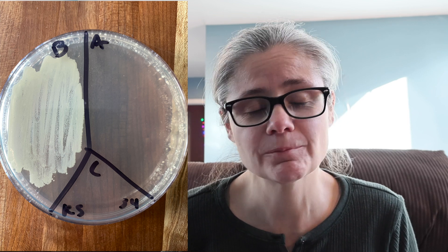Now for some results. The kitchen sink: in the before section we have a ton of bacteria — there's a lot. In the after section, there are very few tiny bacterial colonies. This is pretty spectacular results. Spraying with bleach, wiping and rinsing immediately did a great job at removing the bacteria from my kitchen sink.